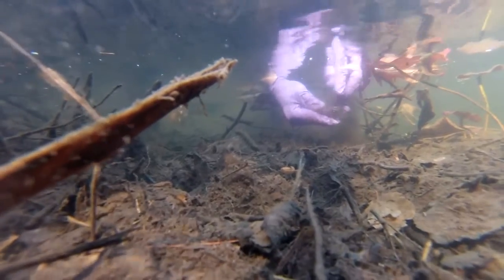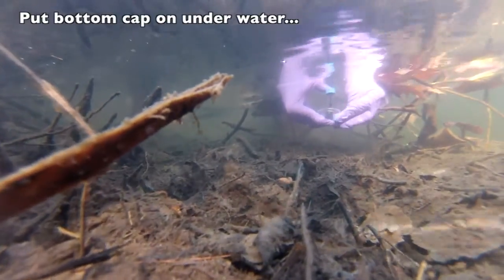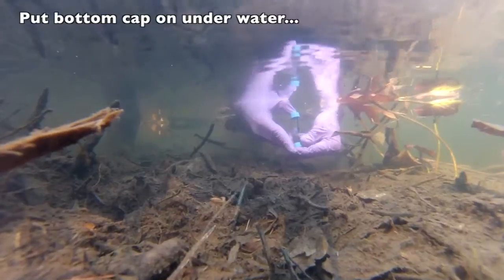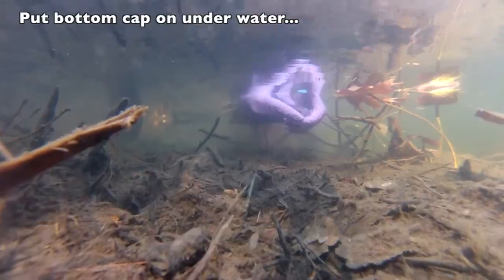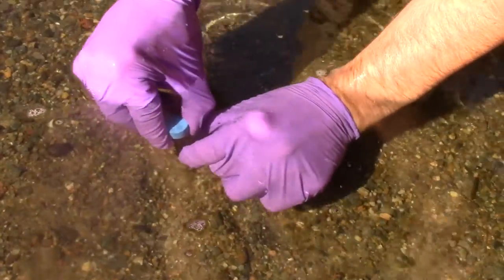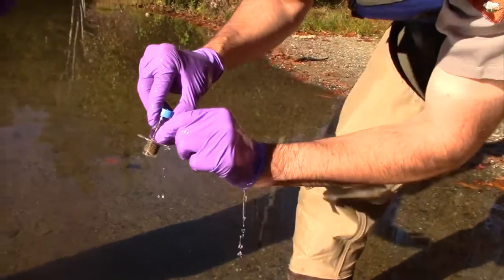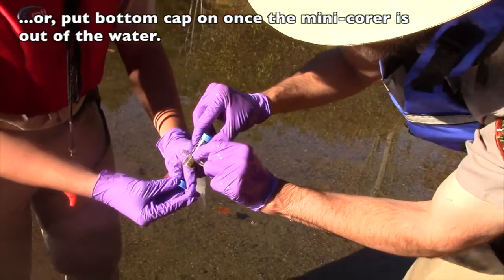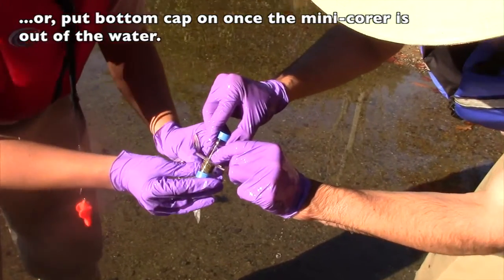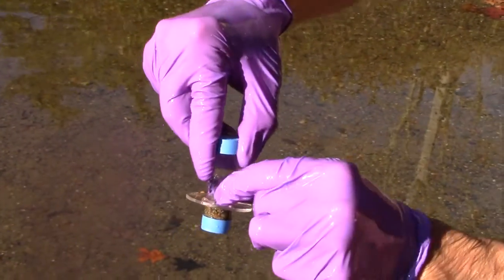Once the mini-corer has been plunged two centimeters into the sediment, the person collecting the sample covers the hole drilled in the side of the mini-corer and slowly removes the core with the sample from the sediment. The other gloved person hands the sampler an end cap. The sampler puts the end cap on the bottom of the tube.